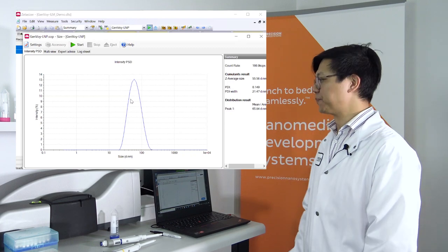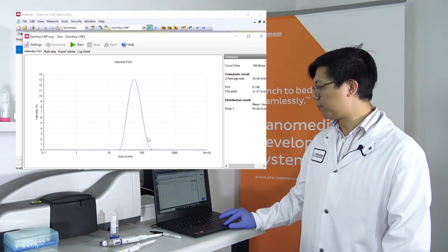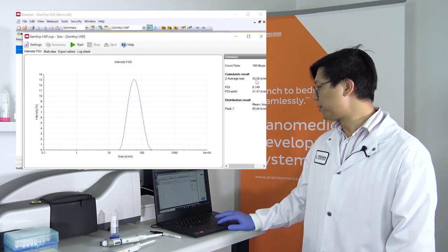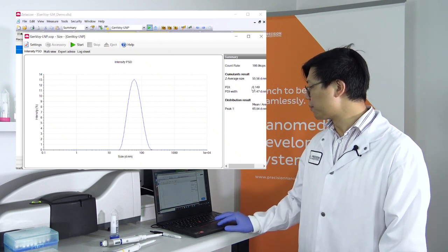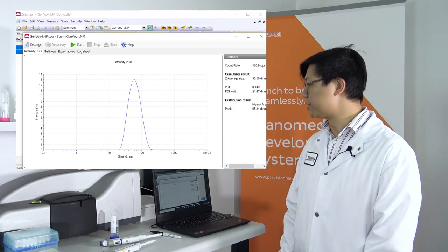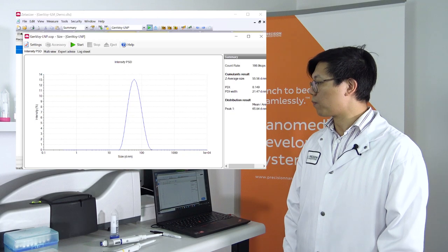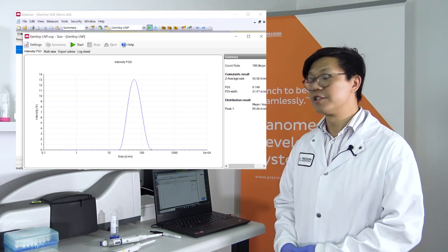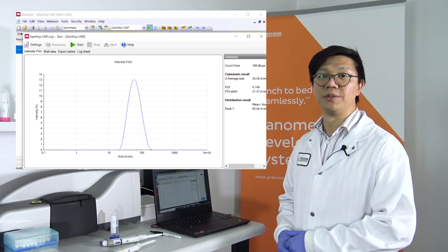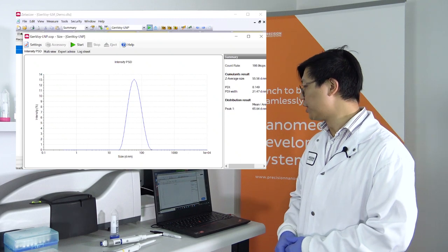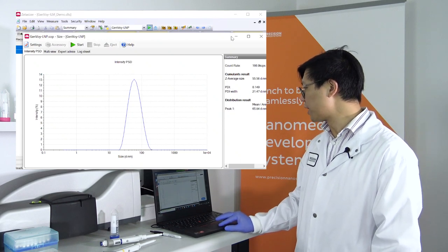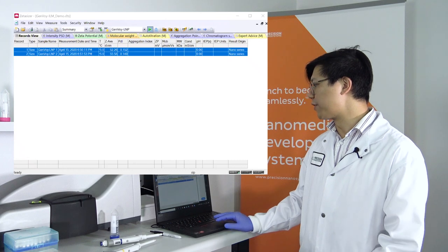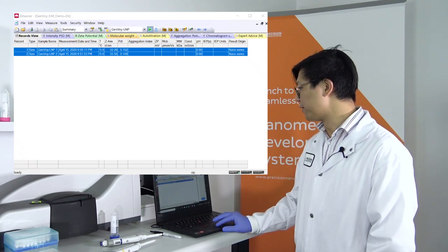So the measurement is done, and we'll take a look at the results. You can see that we have a pretty good single peak here. The average diameter here, the Z average diameter is about 55 nanometers, which is consistent for this type of RNA LNP. And we have a PDI of 0.15, which is also reasonably okay for this as well. After you do the downstream processing, you may see changes in the size. So it's good to do a measurement before and after you do your TFF or your Amicon filtration. Typically, you'll see smaller PDIs after you're done with the downstream processing. And when you look at the two different measurements on aggregate, you can see that they're very close together, about 55 nanometers, and both have very good PDIs around 0.15. And that concludes the demo formulation of GenVoy ILM.